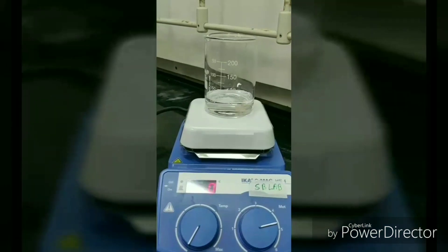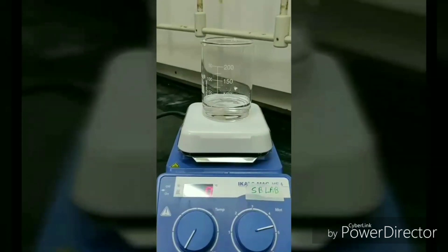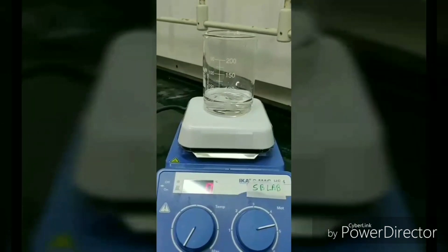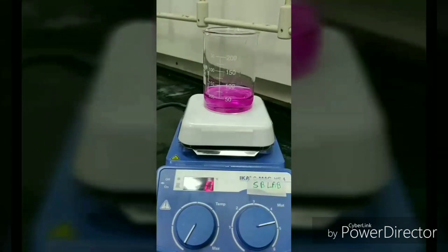To make the solution more alkaline, we added a small amount of NaOH pellets. Further, phenolphthalein is added to get a contrast color.